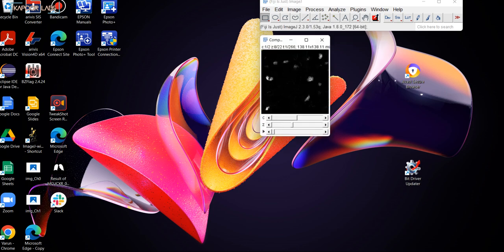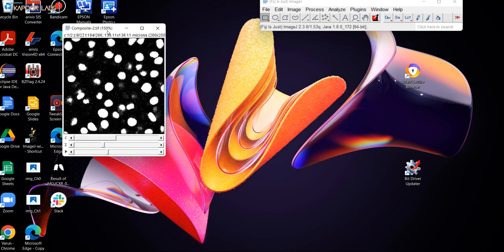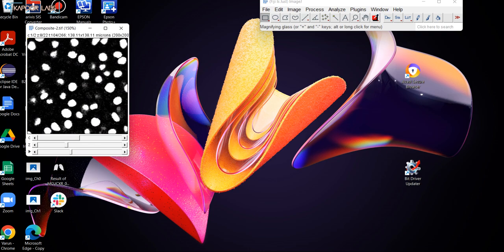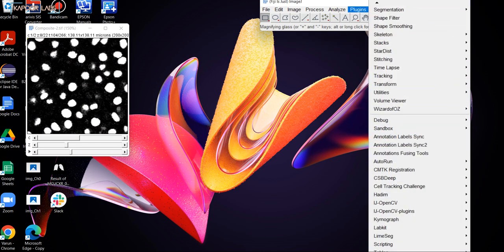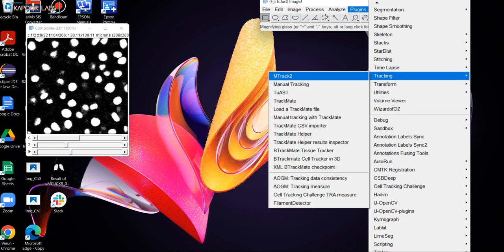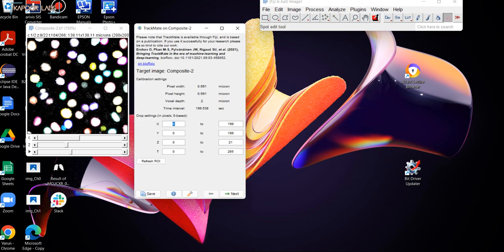So this dataset consists of these cells in one channel over time, and in the second channel is the segmentation image. So once you have such a data set, you can actually use TrackMate, the integer label detector, to find these cells using the segmentation image, and then you can do the tracking with the segmentation image in one channel and the raw image in the other channel.